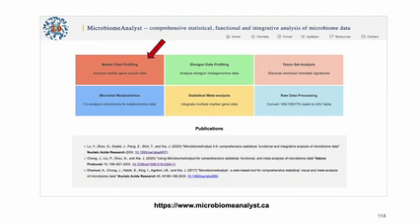What we are going to know after analysis in this module is basically we need the metadata you are interested in. For example, in this example data, we are looking at the difference between the IBD subtype CD group with the control group.